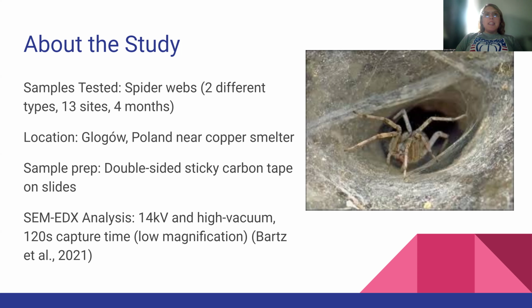For the SEM EDX analysis, the analysts provided 14 kilovolts and a high vacuum mode, with 120 seconds of capture time on low magnification in order for Bartz to gather the results that they used to compare to the ICP-MS results that they were also using, in order to see which one is more effective or if SEM EDX is at all effective with analyzing the particulate matter.